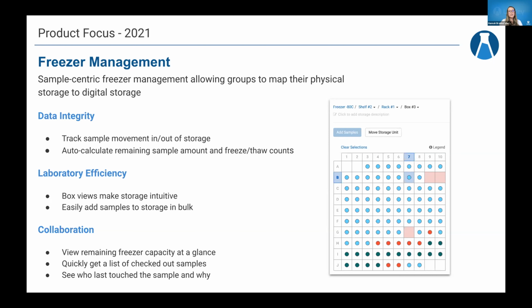And then being able to see who last touched that sample and why. So we have a lot of comments when you're moving samples in and out of storage. And so you'll be able to see exactly what happened there.